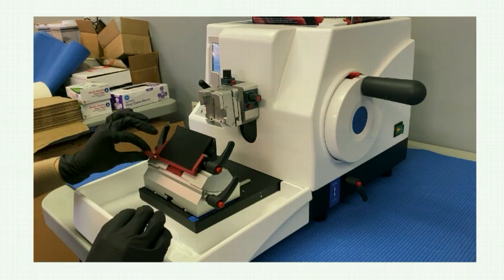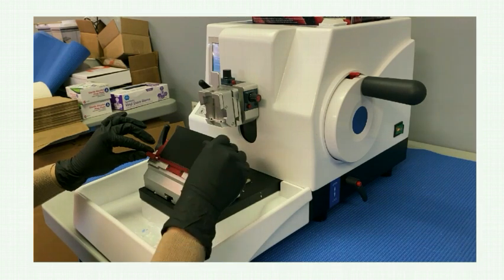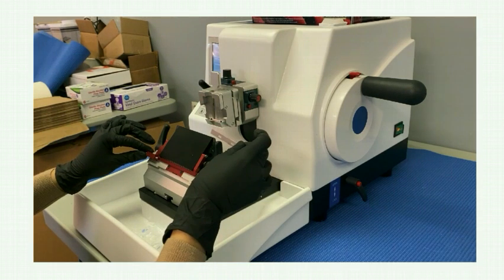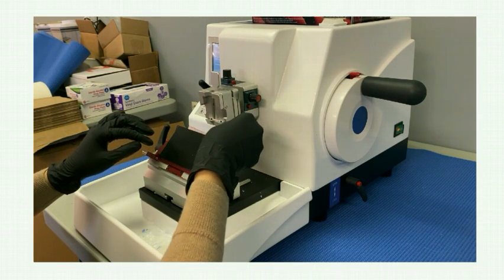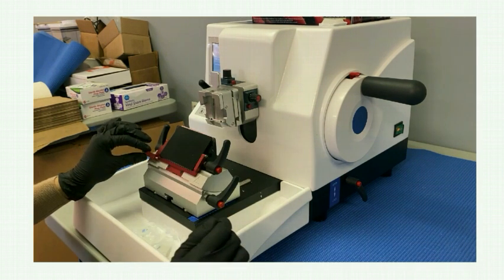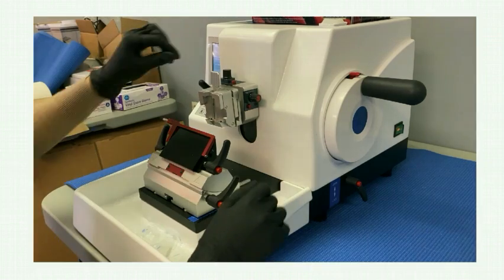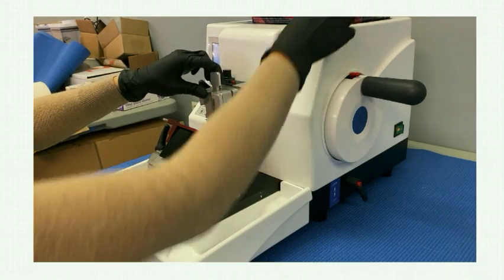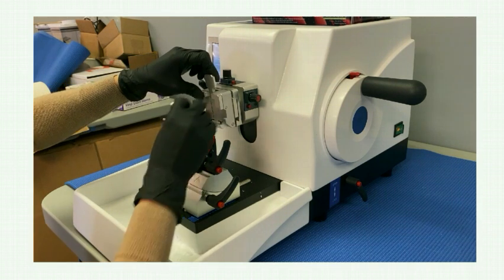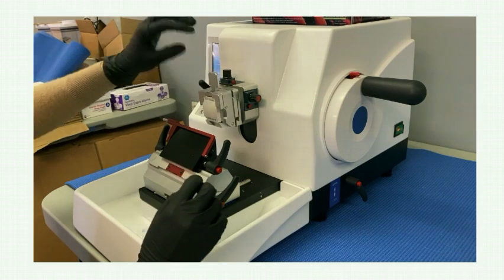Now I can insert a cutting blade and protect the blade using the blade holder, or the blade guard. Finally, I can insert a cassette sample into the specimen head. I can then adjust the specimen head orientation slightly by rotating the knobs on the specimen head, the knobs at the top and to the right.